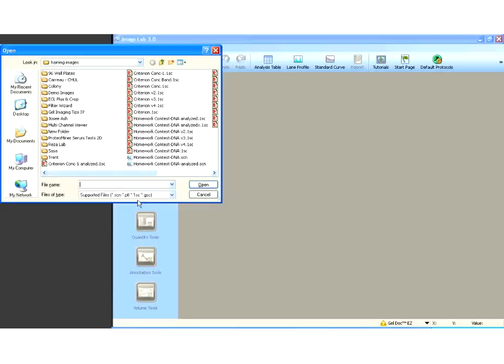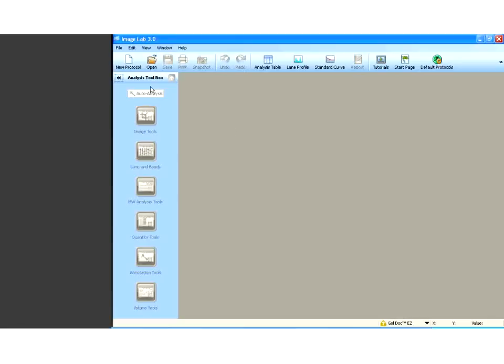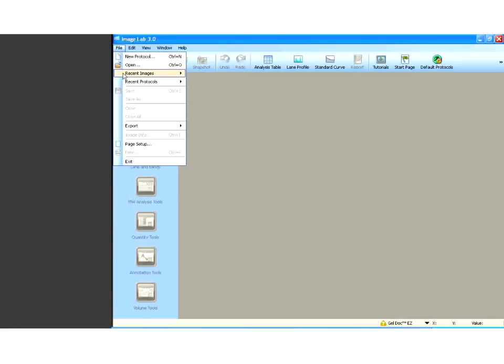Essentially, all of our imagers, with the exception of the GS800, all those files can be opened with this software and analyzed. So, a very nice, versatile package that allows you to look at your data very easily. Now, let's open a file.